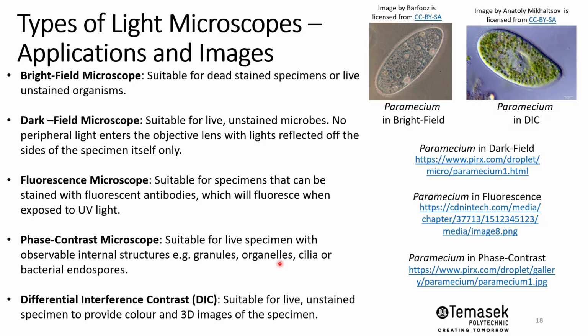There's another type of microscope that gives you differential interference contrast, also known as DIC. This DIC microscope is again suitable for live unstained specimens.